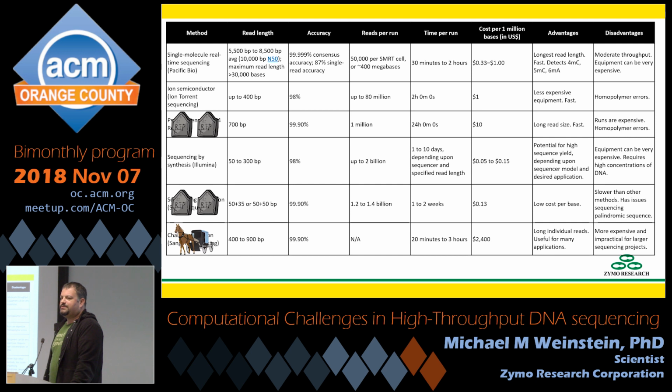And the chain termination sequencing, also known as Sanger sequencing, if you look at its cost per 1 million bases sequenced, it's about $2,400, as opposed to everything else that's usually in the range of a couple dollars to a few cents. Sanger sequencing does not generate a lot of data. Sanger sequencing is actually low throughput sequencing designed for very high accuracy on a very limited sample. Typically one thing that you just want to confirm with high confidence. So that's not super relevant to us today because that does not present really any data problems whatsoever.